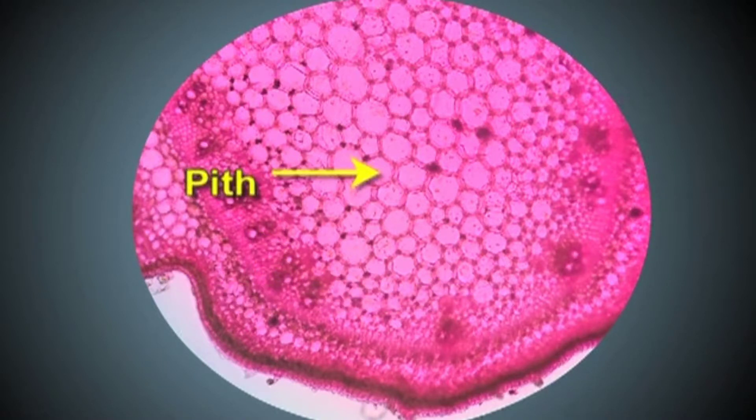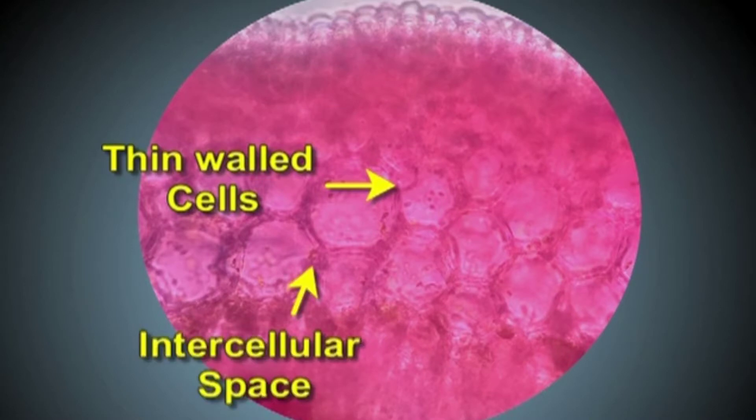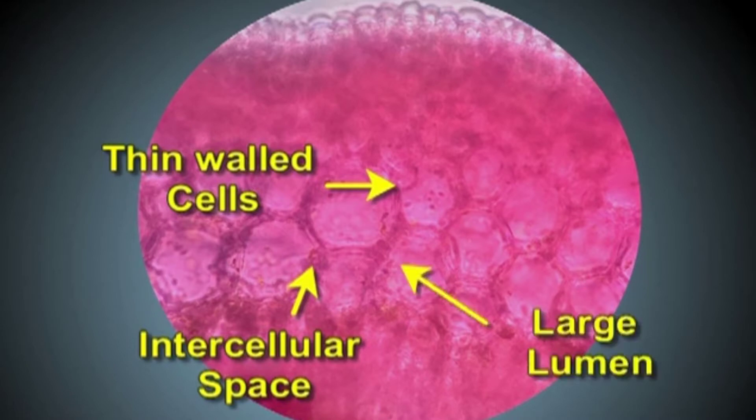Here we find that the pith and the cortex consist of very thin-walled cells. These thin-walled cells have a circular outline and are loosely arranged. They have intercellular spaces, large lumen, and they are living cells. Such thin-walled cells are called parenchyma.